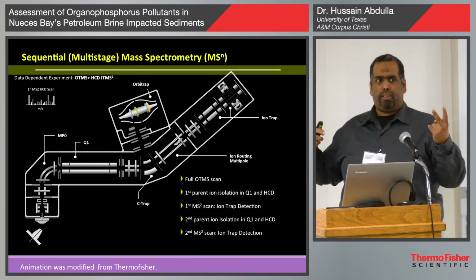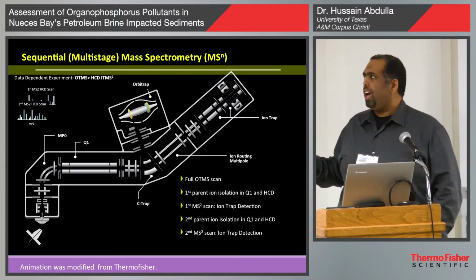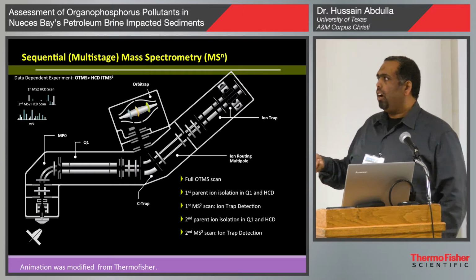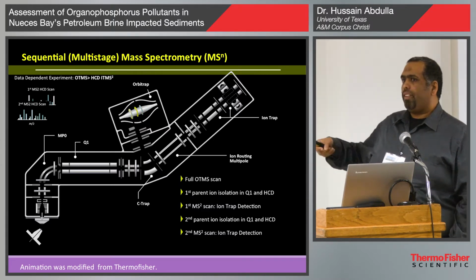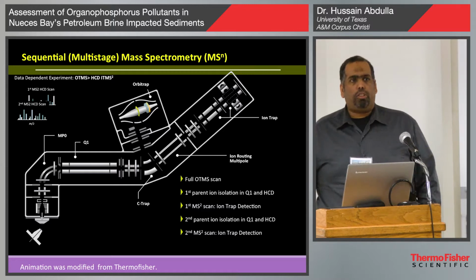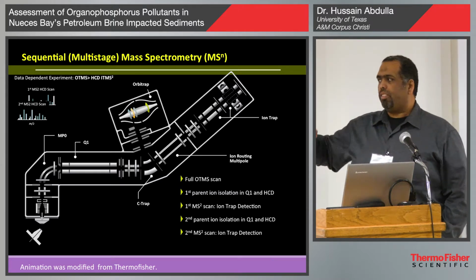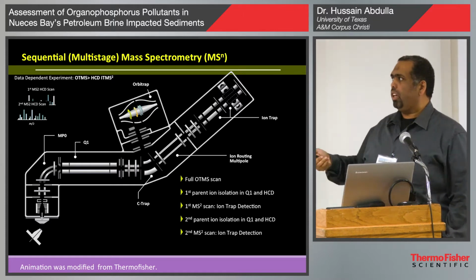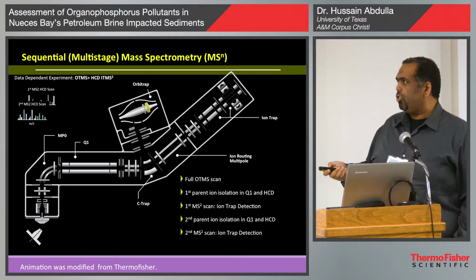So you can imagine you have 2 mass specs in one shot, in one sample. One of them is collecting the full scan, and the other, the Ion trap, is collecting the fragments. The scan speed for the Orbitrap is 18 hertz. That means I can collect 18 spectra per second. For the Ion trap, it's 20 hertz. For example, the FTICR mass spec, even though it has the same resolution as the Fusion Orbitrap, has a scan speed of only 1 hertz. So we cannot use HPLC attached to the FTICR MS because of the low scan speed. But with the Fusion, it allows us to take full advantage of the separation with the HPLC and UHPLC and have two mass detectors at the same time, in front of the quadrupole, which will do the separation.